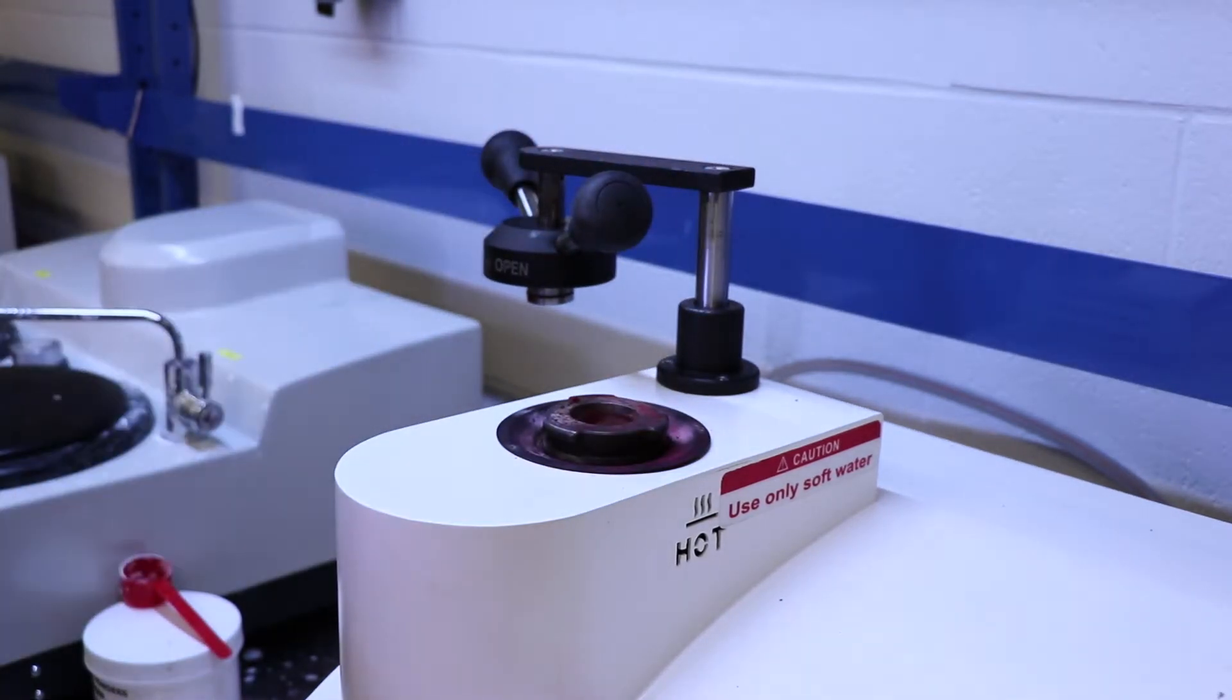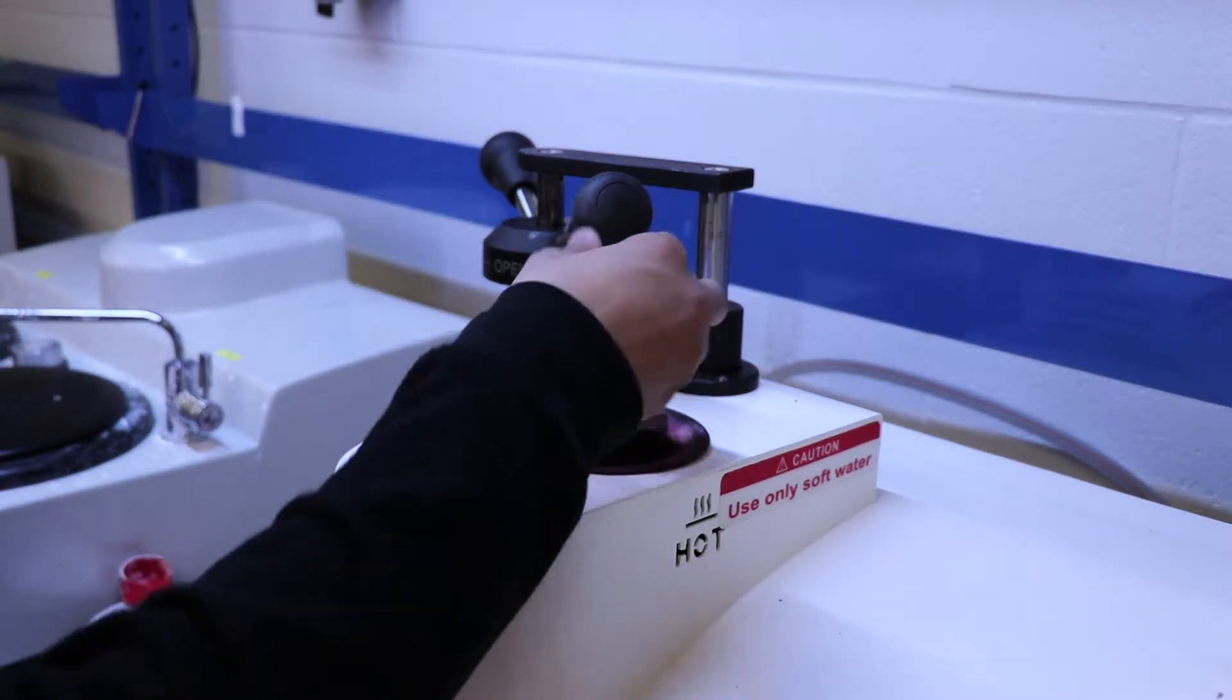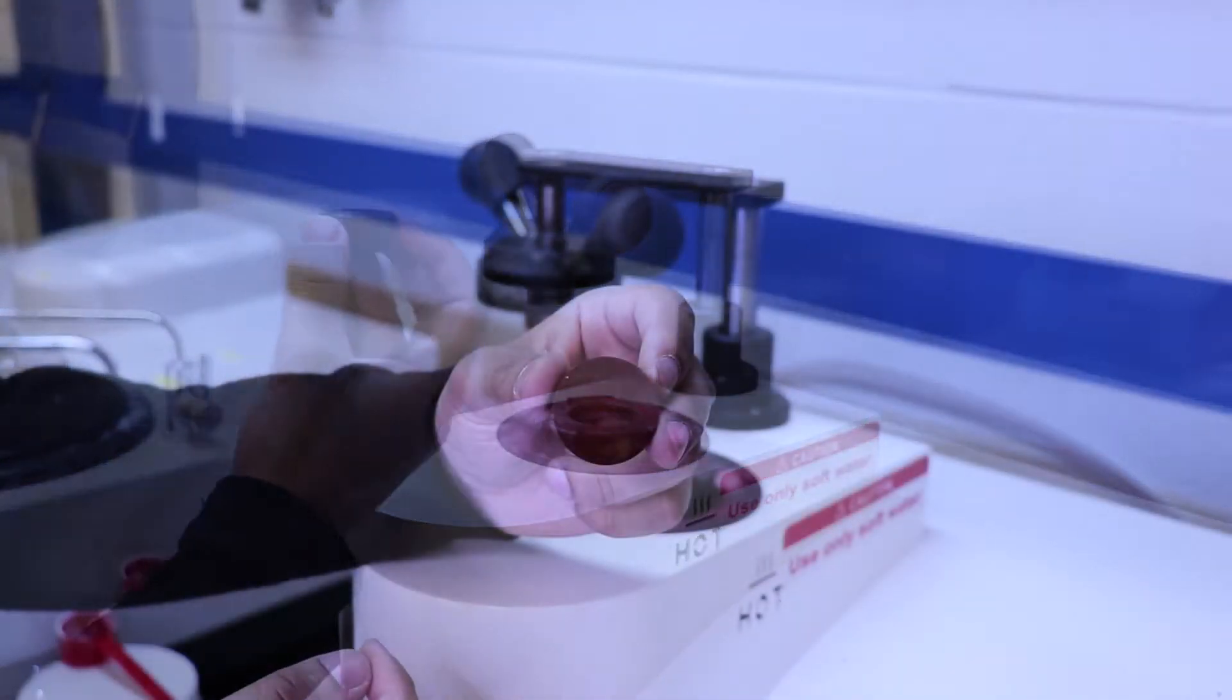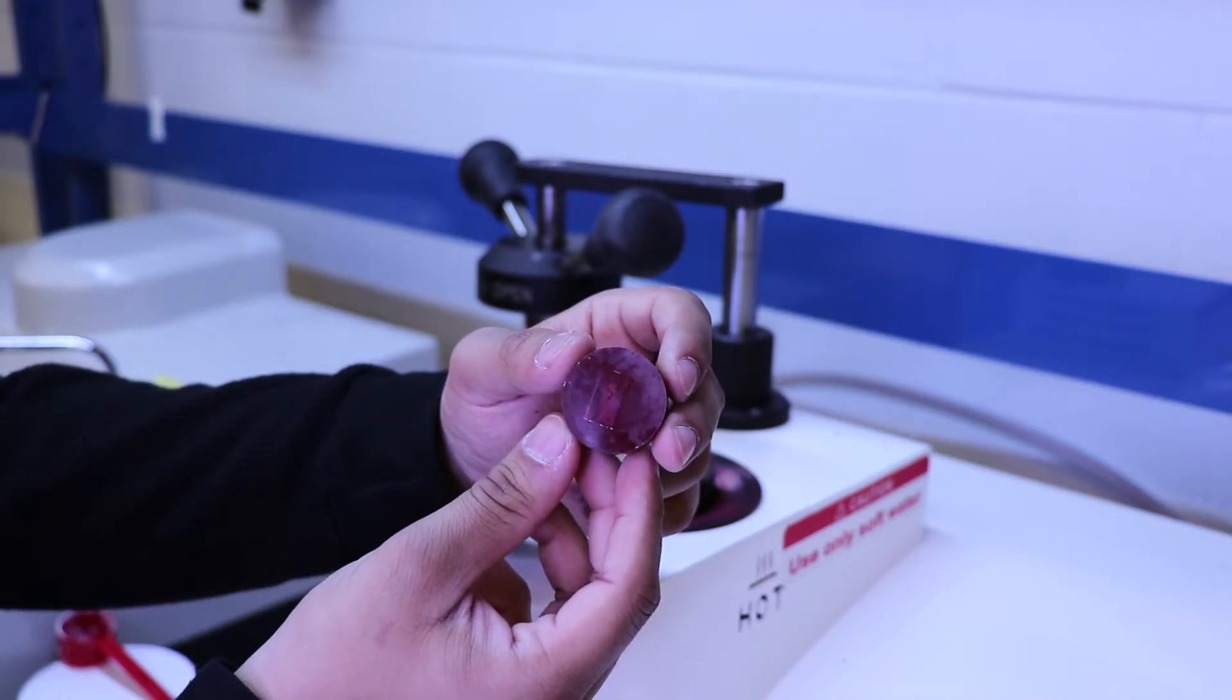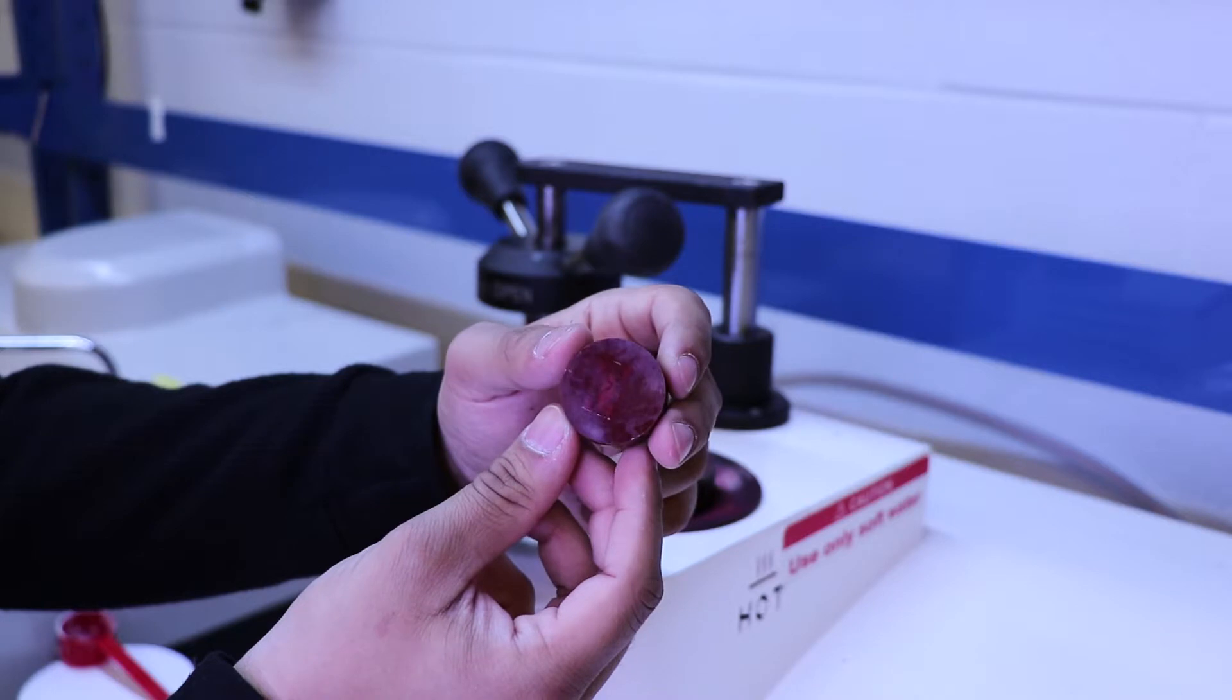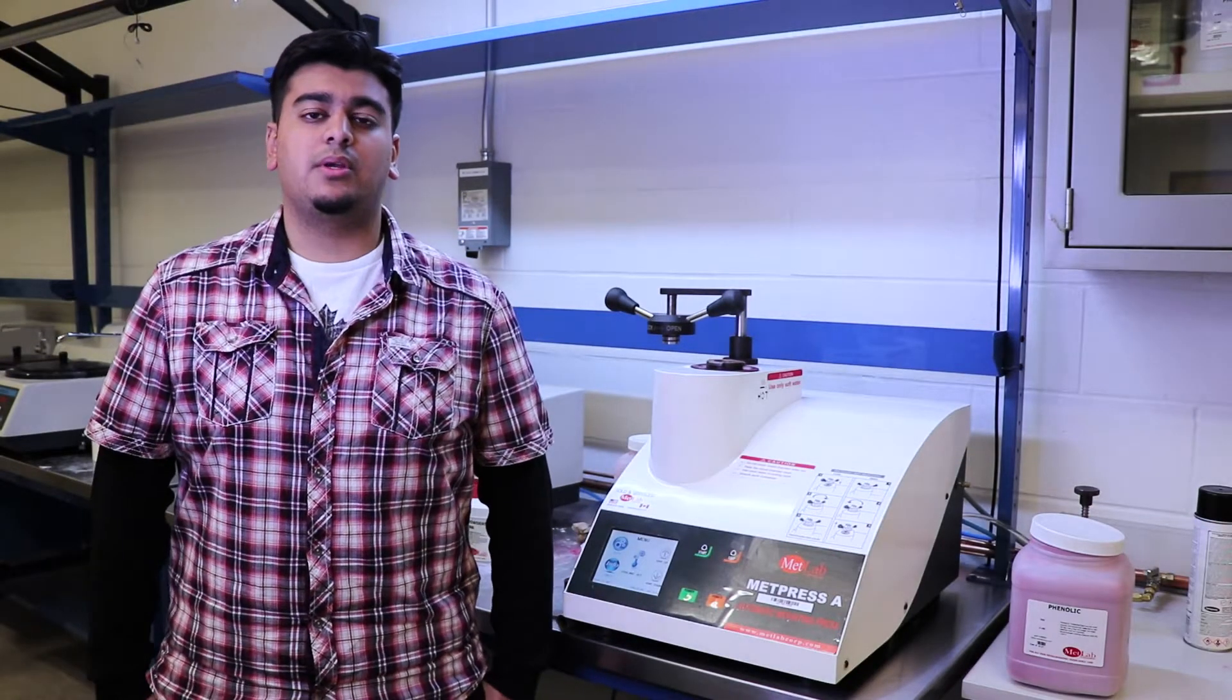Once you get that off, just take that out of the way by rotating it to the left side and then you can pick up your sample. So as you can see, you can't see your sample. So what you're going to have to use is the polishing machine to wipe off the excess phenolic.